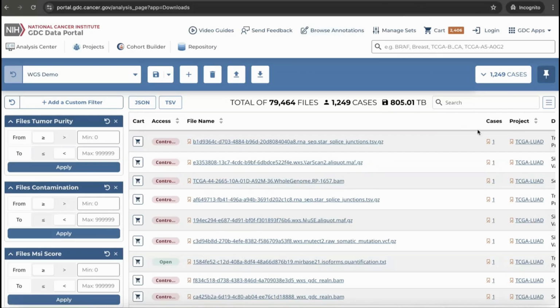Okay, the next question. This is from the same person who is asking about comparing the new whole genome sequencing workflows with other ones. Just as a follow-up, have you assessed the sensitivity and specificity of the new whole genome sequencing workflow, e.g., by benchmarking against reference data sets? That's a good question. No, we haven't.